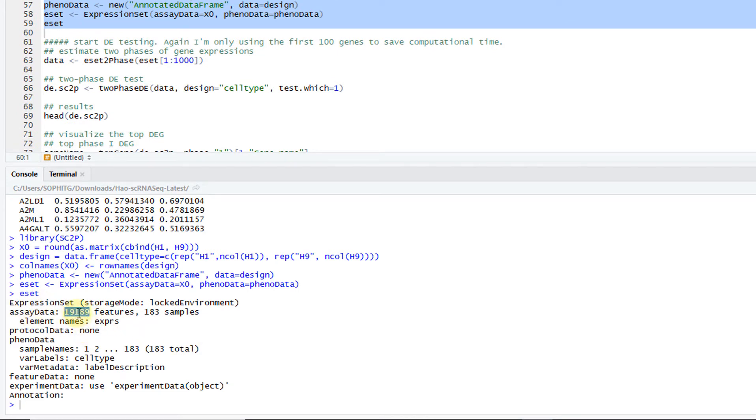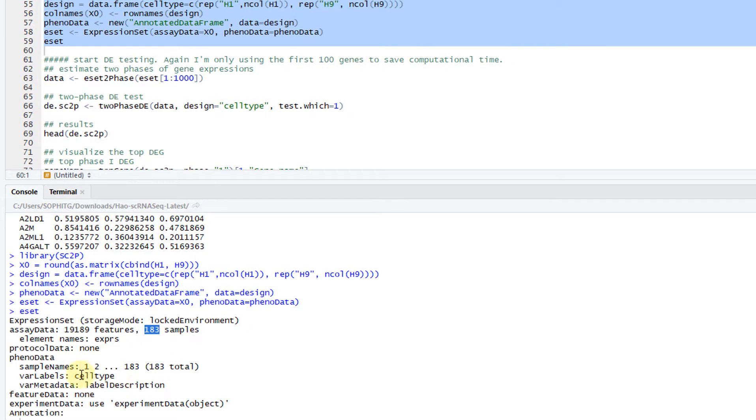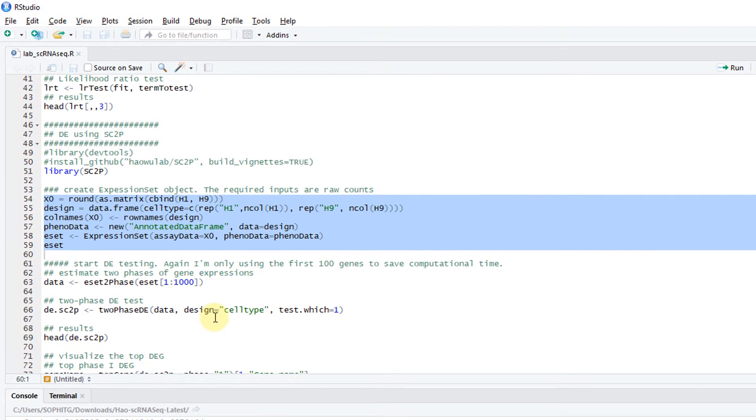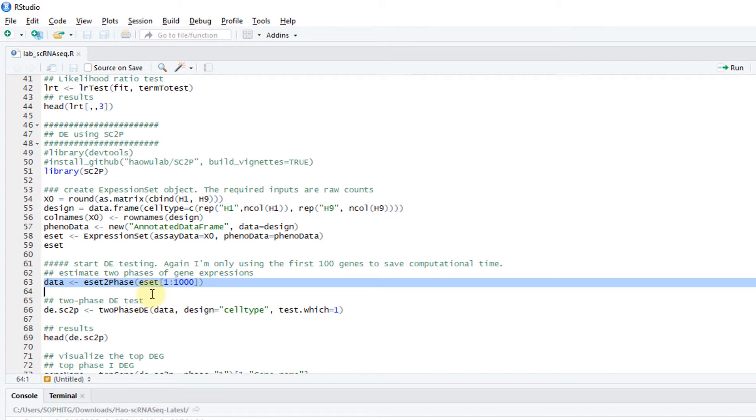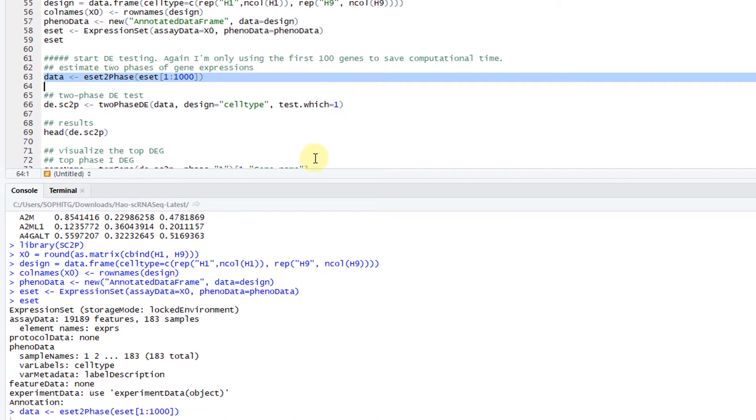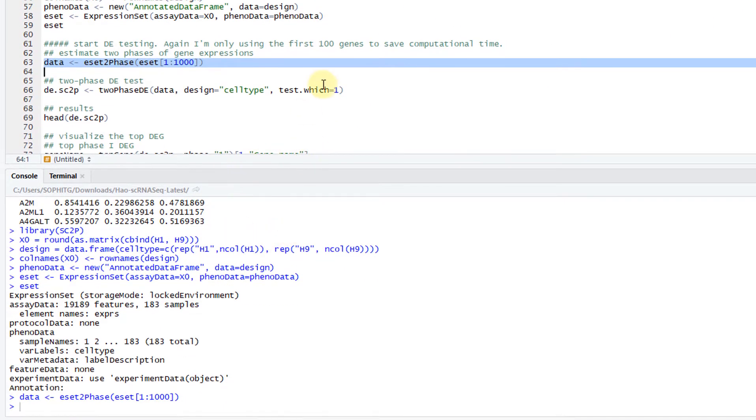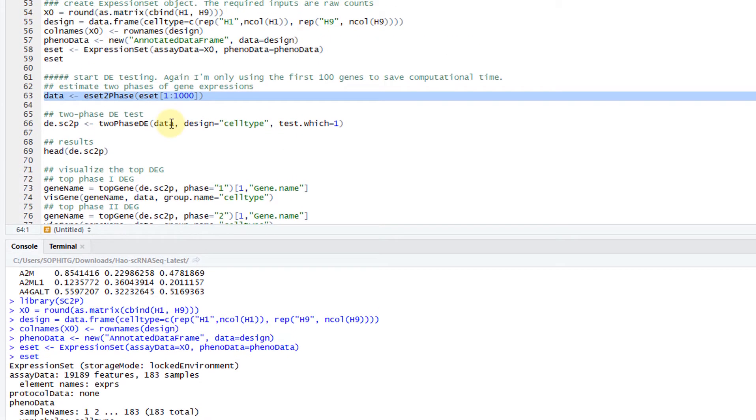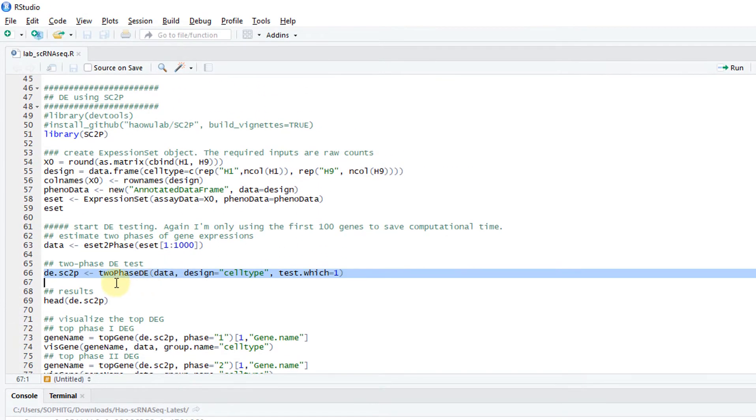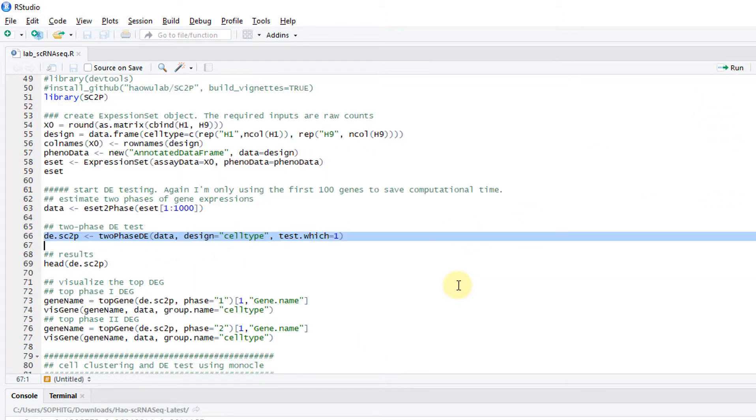You have an expression set. You have this many features. Basically 19,000 genes, 183 samples, that means 183 cells, and so on. The first step is to estimate the phase. This is very similar to the thresholding step in MAST. But we call it phase. Again, I only run the first 1,000 genes to make it a little faster. Then after estimating the phase, I can do a two-phase differential expression test. Basically test the burst frequencies and burst strength.